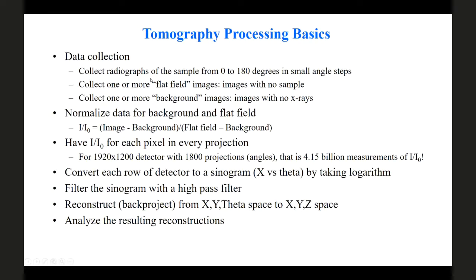Okay. So we've already collected the data. We got radiographs of the sample as we rotate from 0 to 180 in small steps. We collected a bunch of flat fields. We didn't collect background images or dark fields.